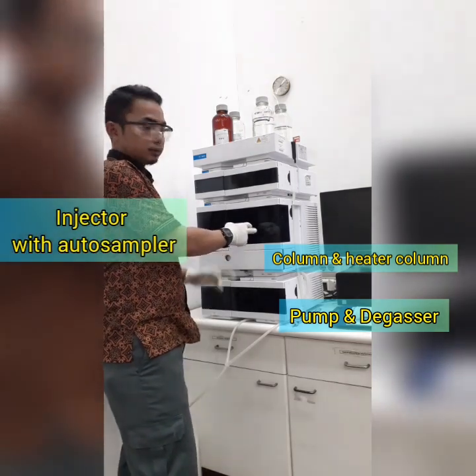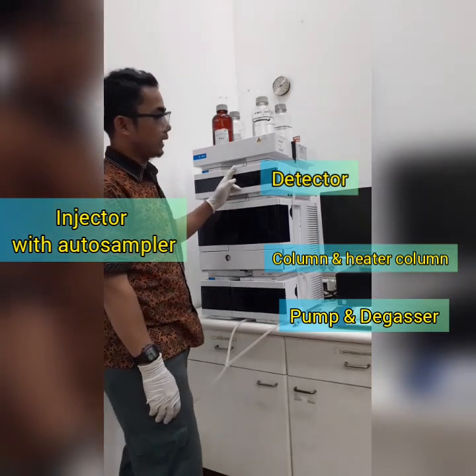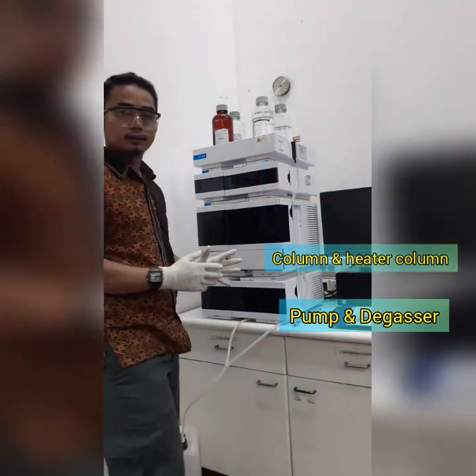And then this is autosampler, and this is detector. After detector, the data can be displayed and analyzed by computer. This is the unit of Agilent.